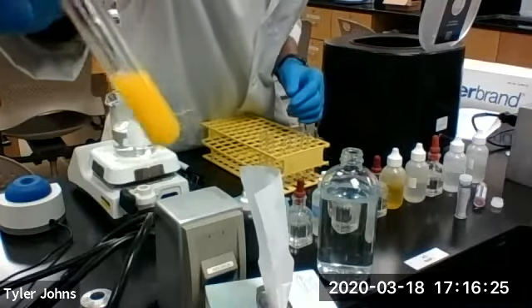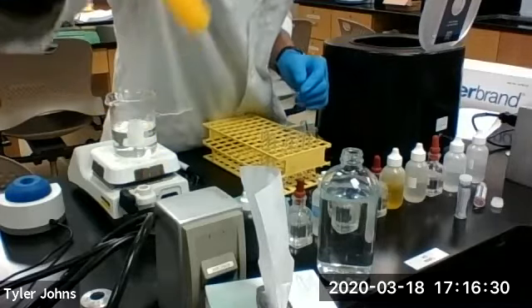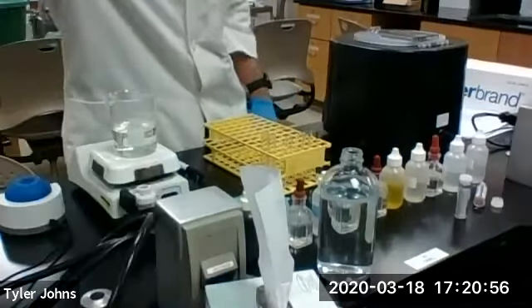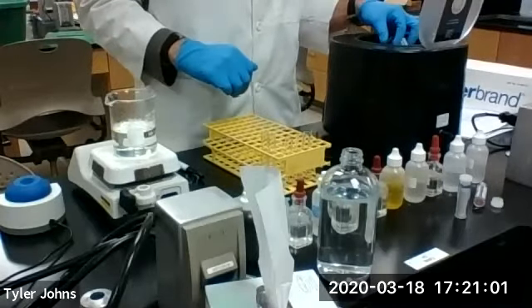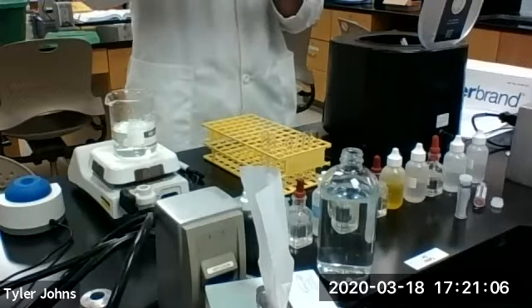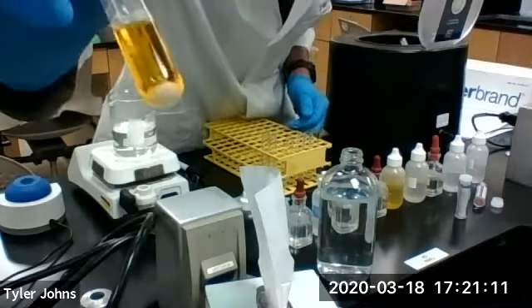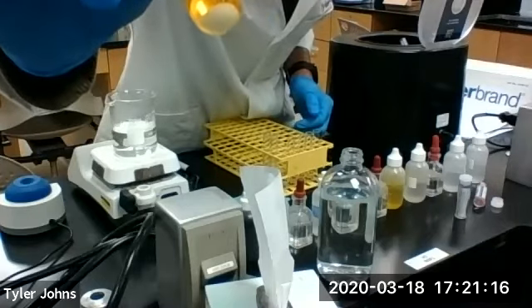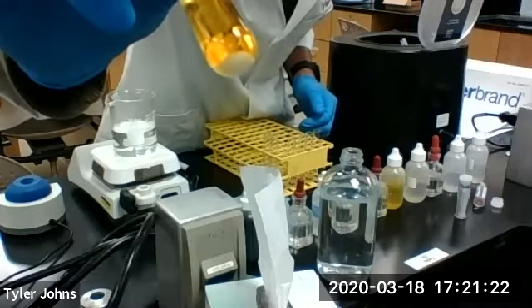You can see we are getting a precipitate, but we will centrifuge to be able to determine what color that precipitate is. Okay, so our centrifuge is stopped. We remove our tube, and we were looking for a white precipitate. As you can see, we have a white precipitate at the bottom of our test tube. That precipitate is barium sulfate, and this confirms the presence of the barium ion.